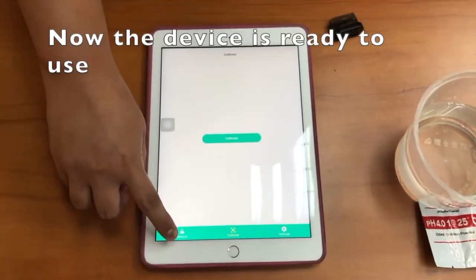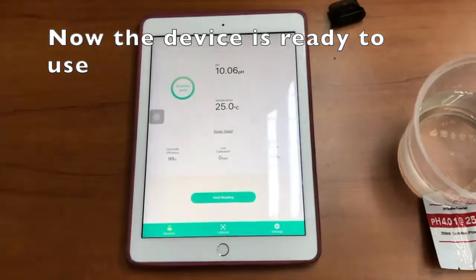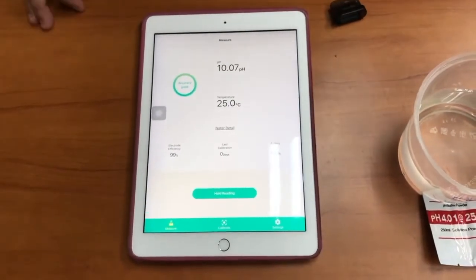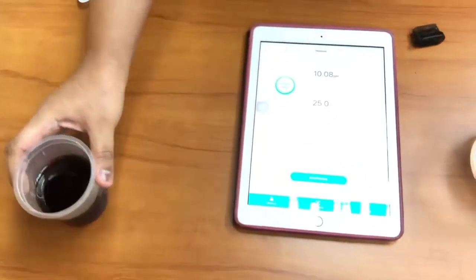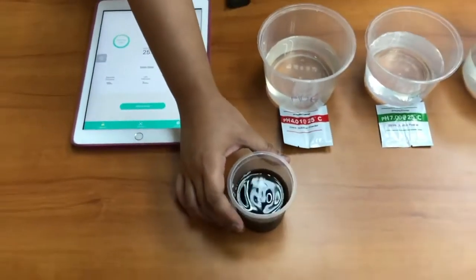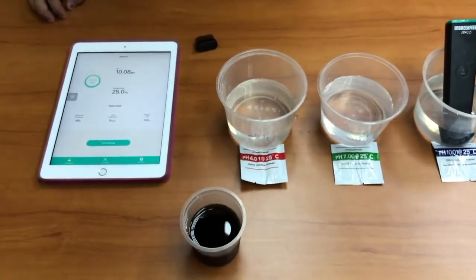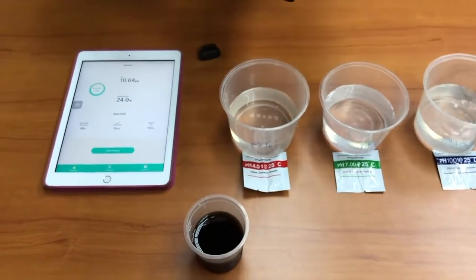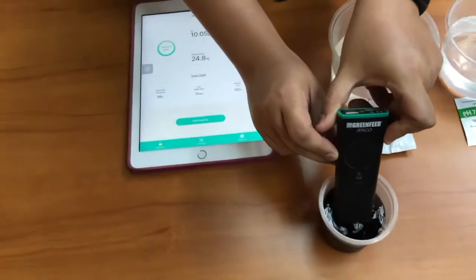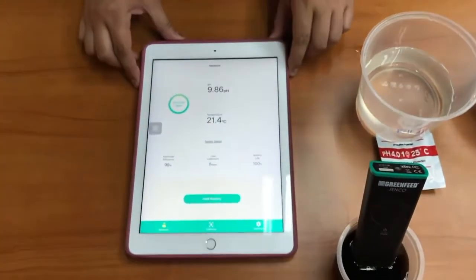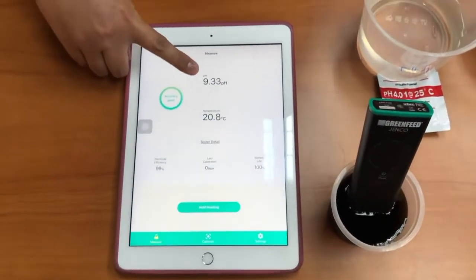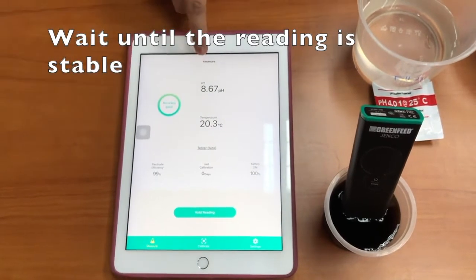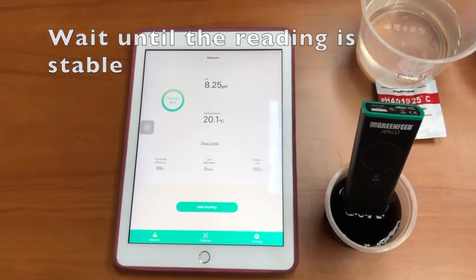Now we can start to measure our solution. This is an unknown solution, and we're going to check what the pH value of this solution is. I'm going to take our pH meter and put it inside here to see what the pH is. You can check the pH value here—it will stabilize at this place. Now let's see.